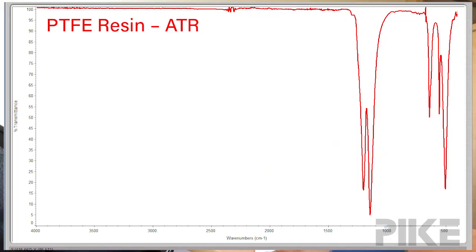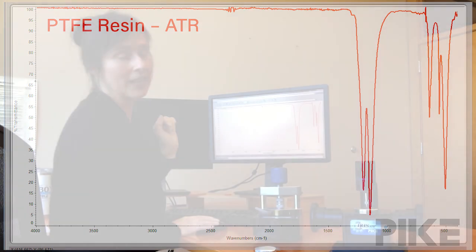Okay, the first spectrum we're going to look at is that obtained with the ATR. As you can see, it looks like Teflon.